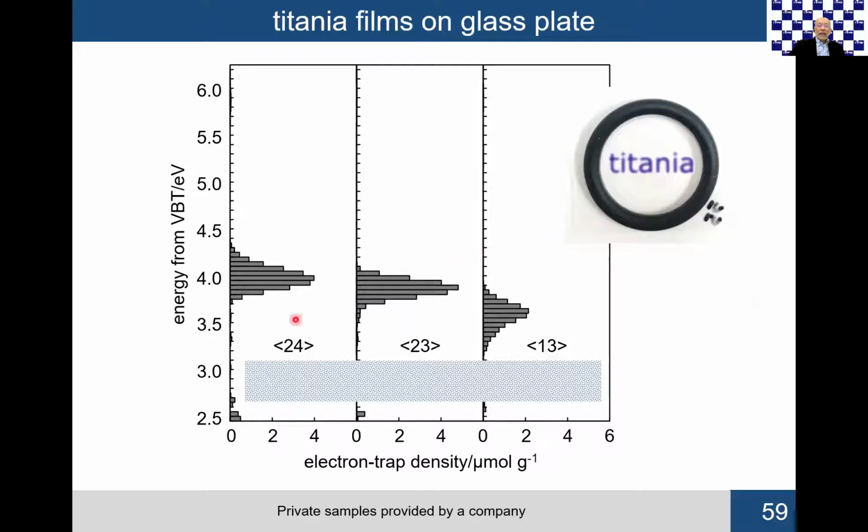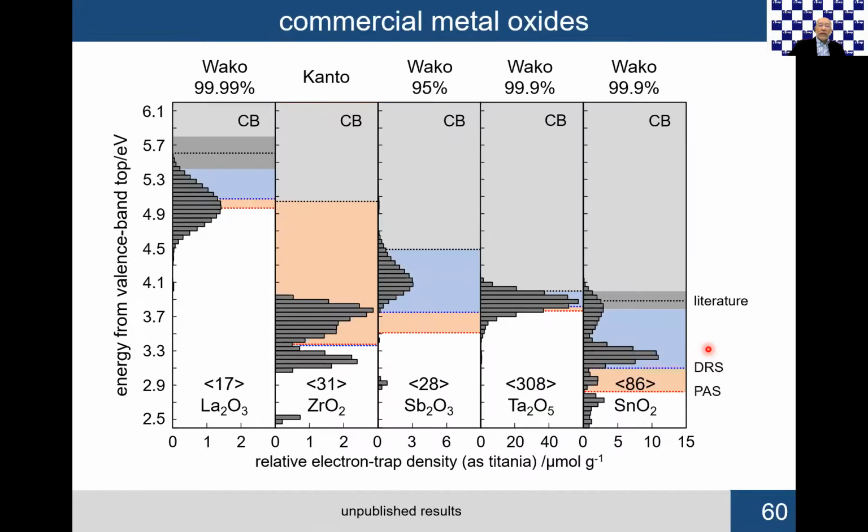And clearly, the peak position and the shape are completely different depending on the kind. In this case, the titania is totally amorphous, no crystalline phase. But it is possible to check the difference by using this technique. Again, this is the only possible technique to check the difference of structure.